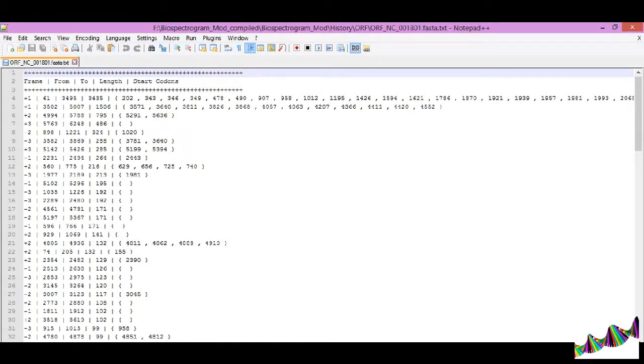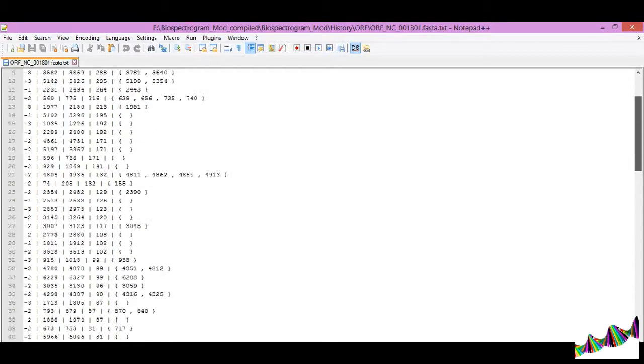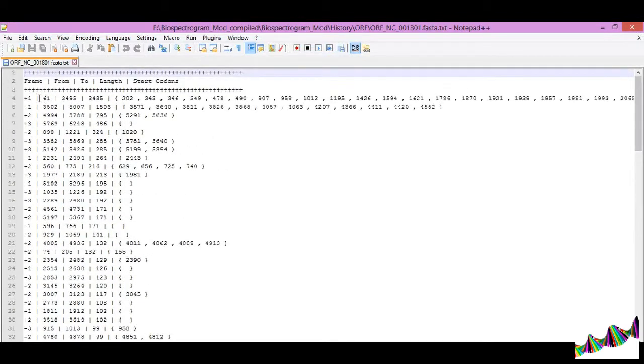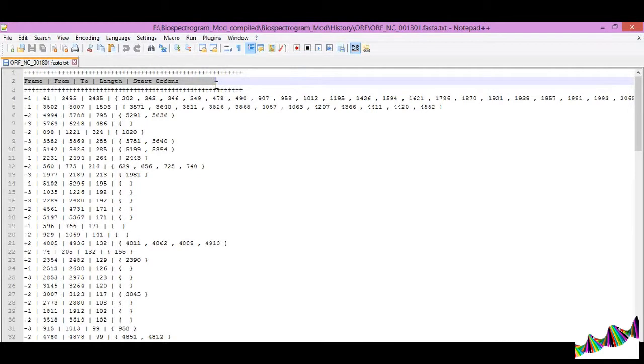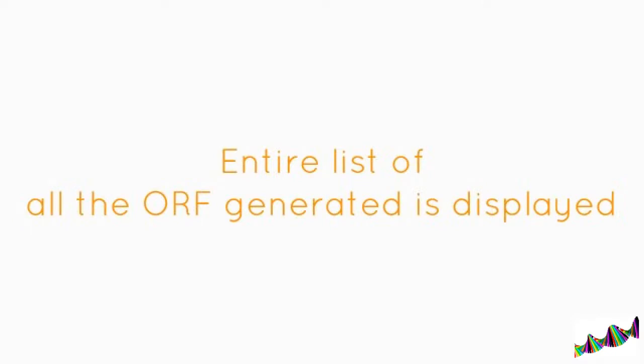This displays the complete list of the ORFs generated for the sequence of interest. It also gives the frame, the from-to position, length, and the positions of the start codon.